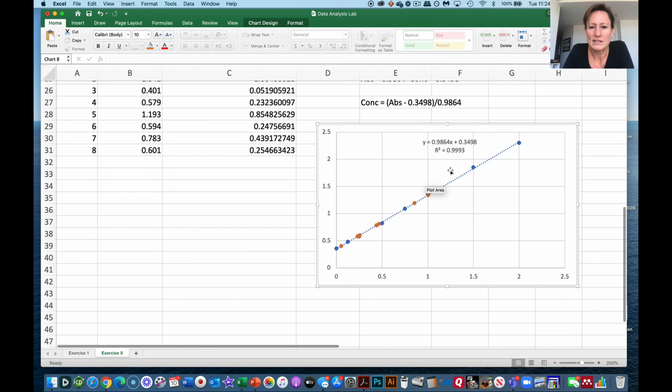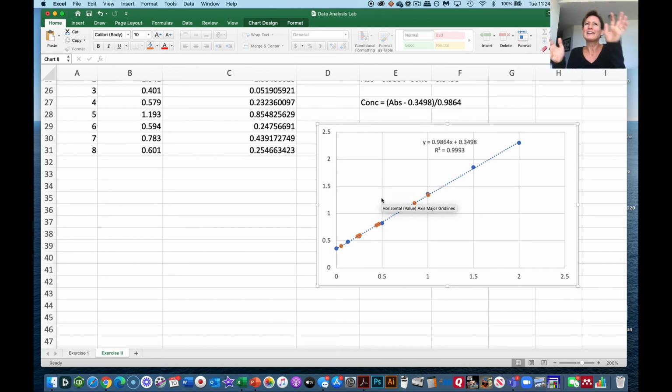And look at what we see here. Again, this is not what you normally would do. You don't plot your data on your standard curve. So I want to make sure I say this like 12 times so nobody thinks that this is what you do. But this is just a proof of principle to indicate that's where we would expect our red data to be. Because we used this equation of the line to actually determine what the Y, use that Y value, that absorbance, to figure out what my X was. These should all fall on the same line.